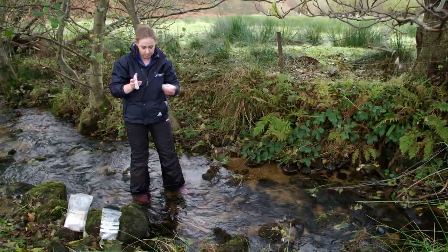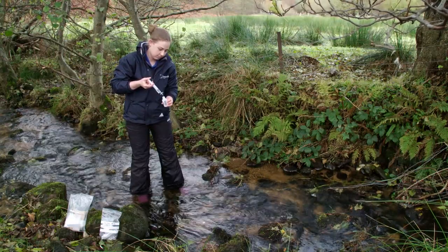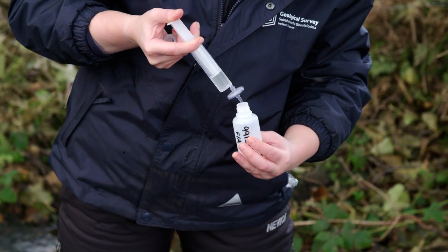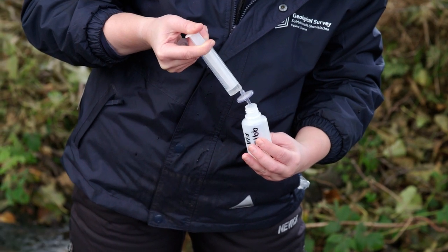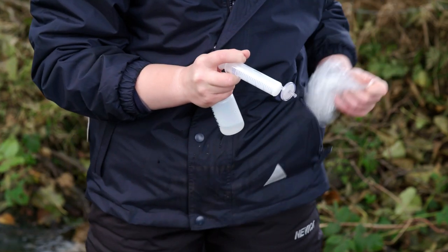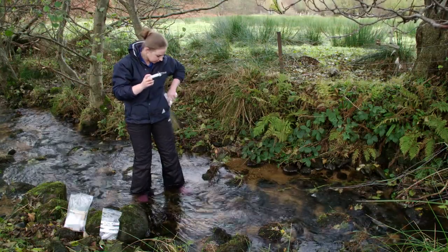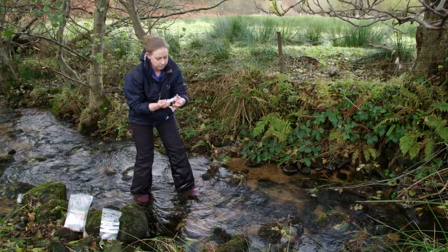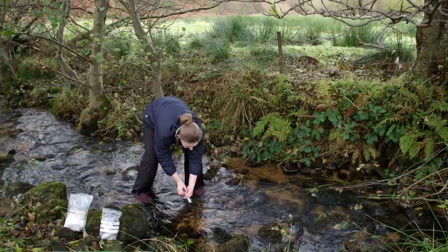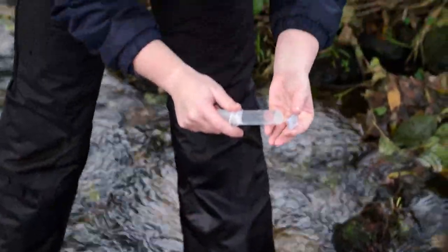Do not put the syringe, cap or bottle down onto a surface and risk contamination. Once the bottle has been pre-rinsed three times, you may begin filling the bottle with filtered water. When the syringe is empty, screw the cap back onto the bottle and return it to the polybag. It will take several syringefuls to fill the bottle. Remove the filter, taking care again to only handle it on the edges, and refill the syringe. Replace the filter and retrieve the partially filled bottle from the polybag.